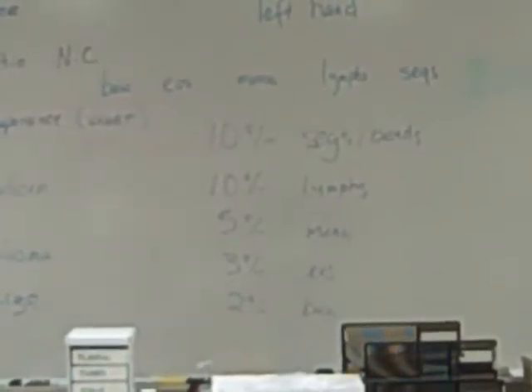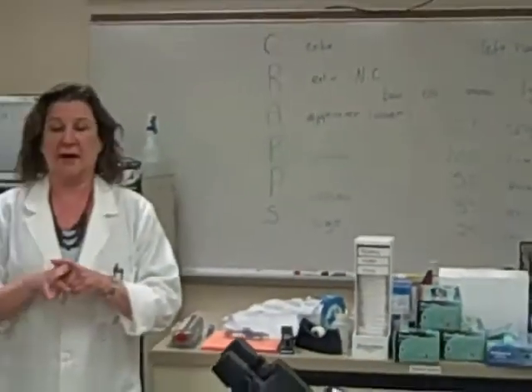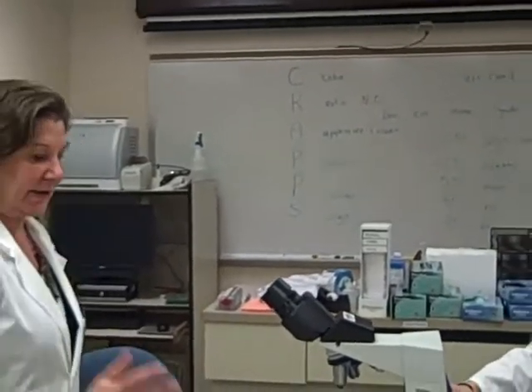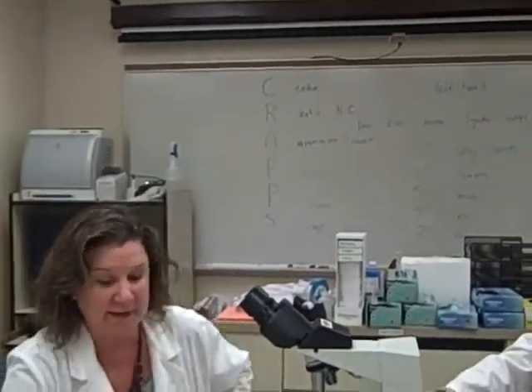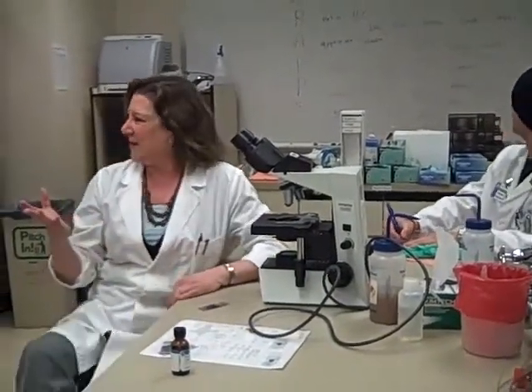Now we'll do the first maybe couple together, so don't worry about getting microscopes out now. But let me show you a couple of tips about focusing and putting your slides on the microscope. Now you guys are used to, in 11-13, looking at pee under the microscope, right? That's wet and it's not stained.